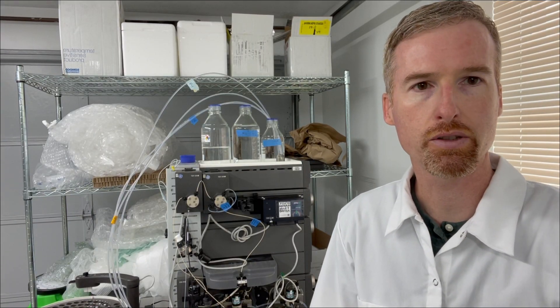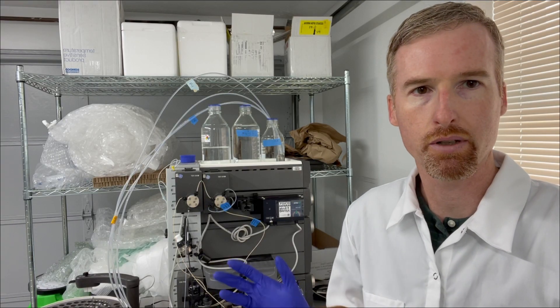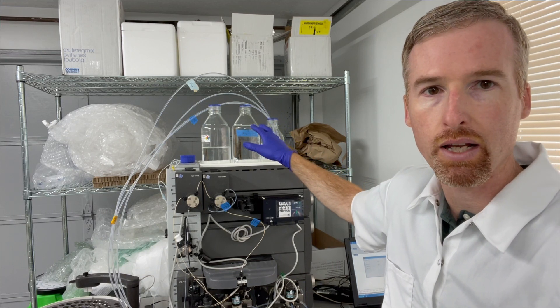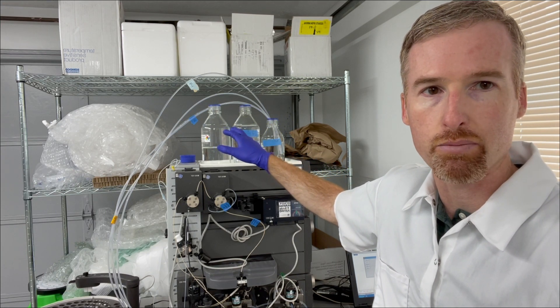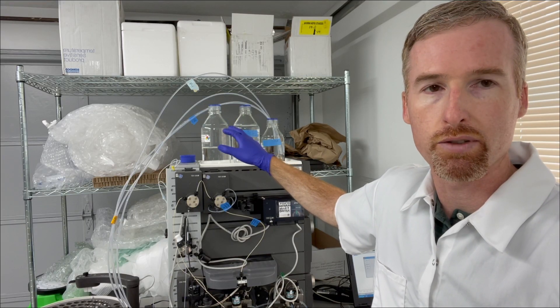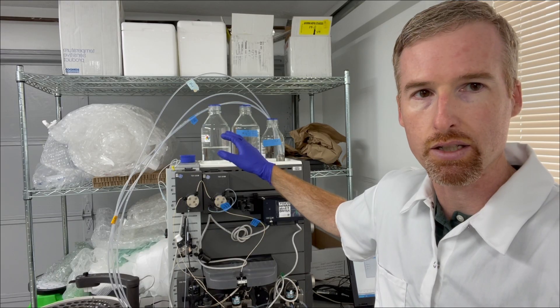Okay, so I finished filtering and degassing my buffers and water and I'm here at the FPLC. You can see I have one liter of buffer A, half a liter of buffer B, which is just the same as buffer A but with 1.5 molar salt added to elute proteins from our anion exchange column.